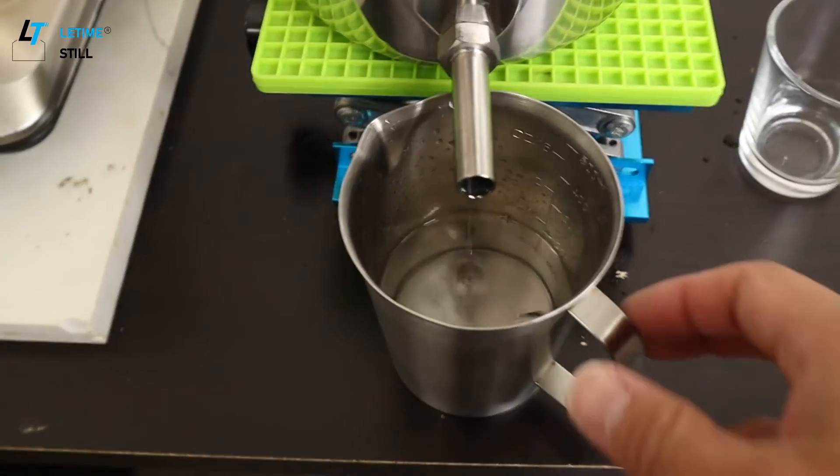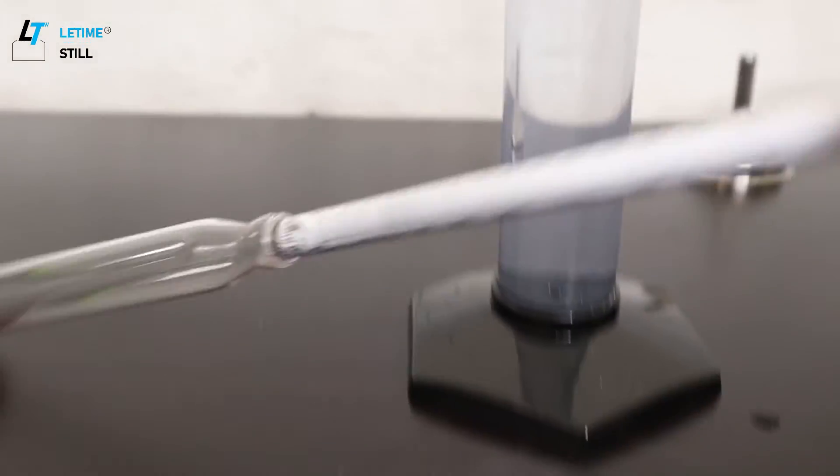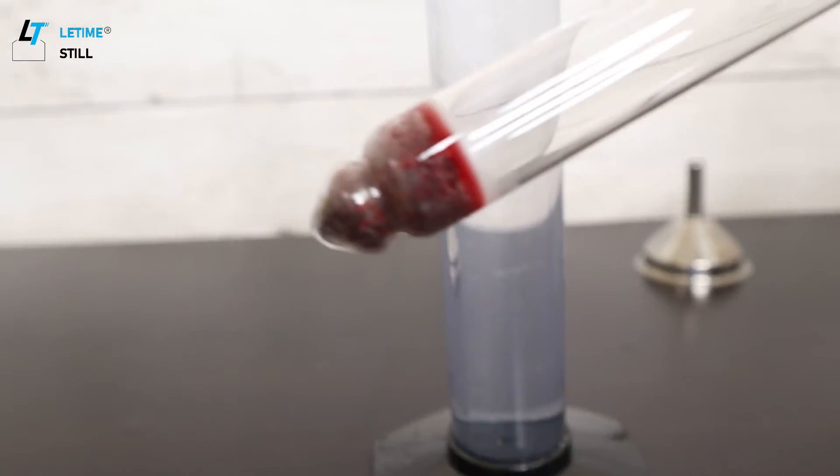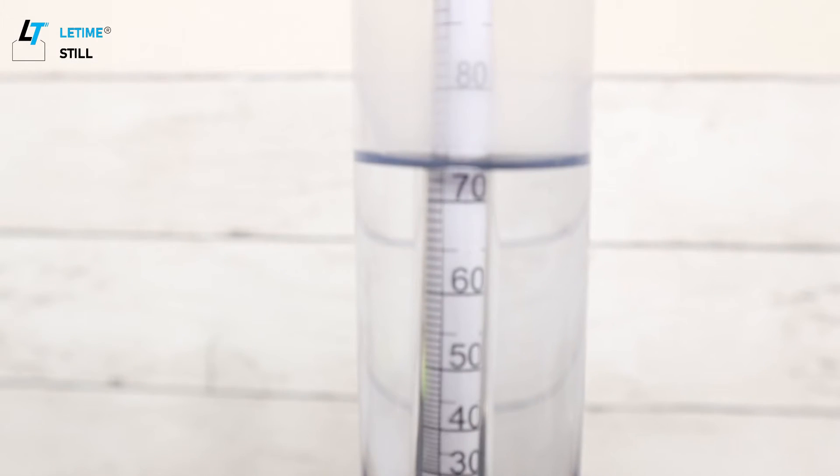To measure the concentration of alcohol we can use a hydrometer. A hydrometer uses density to measure the concentration of alcohol. You can see the reading is 75, which means 75% alcohol.